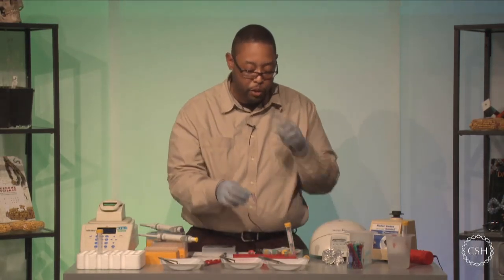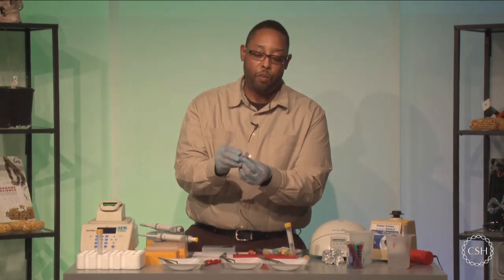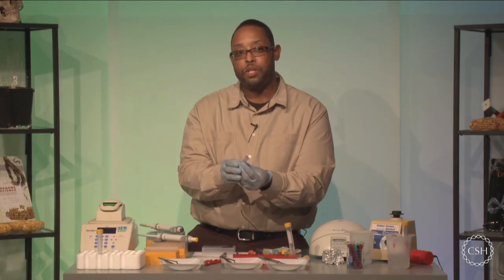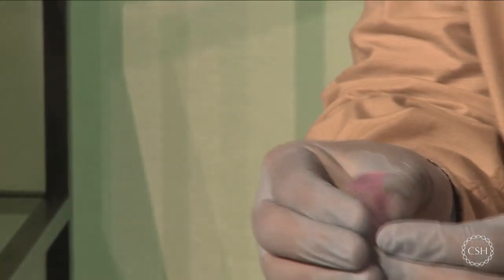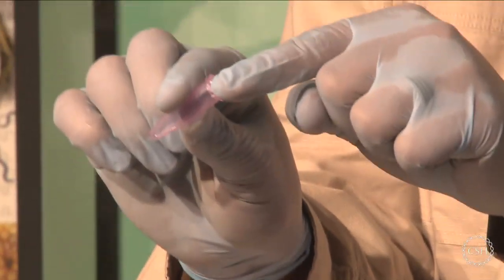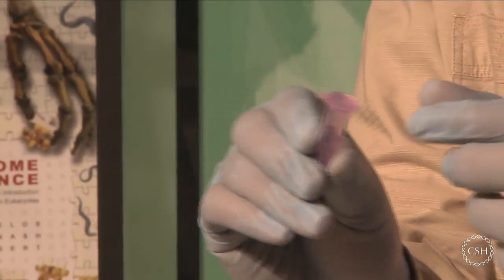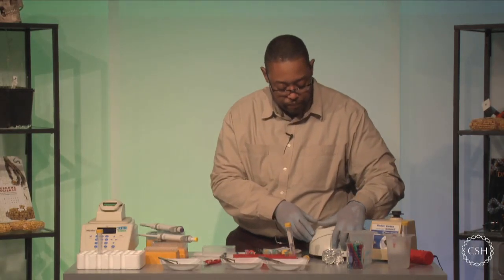But one thing that I mentioned a little bit earlier is that your test tube has a hinge on the very top of it. And you're going to want to make sure that your hinge is facing out towards you so that you can see that the pellet is underneath that area of the test tube. So it's going to be very important that you physically see that. Okay. So please make sure that you're facing that hinge right at the bottom of your test tube. Okay. So these hinges are facing outward towards us so that we can find our silica pellet right underneath it.